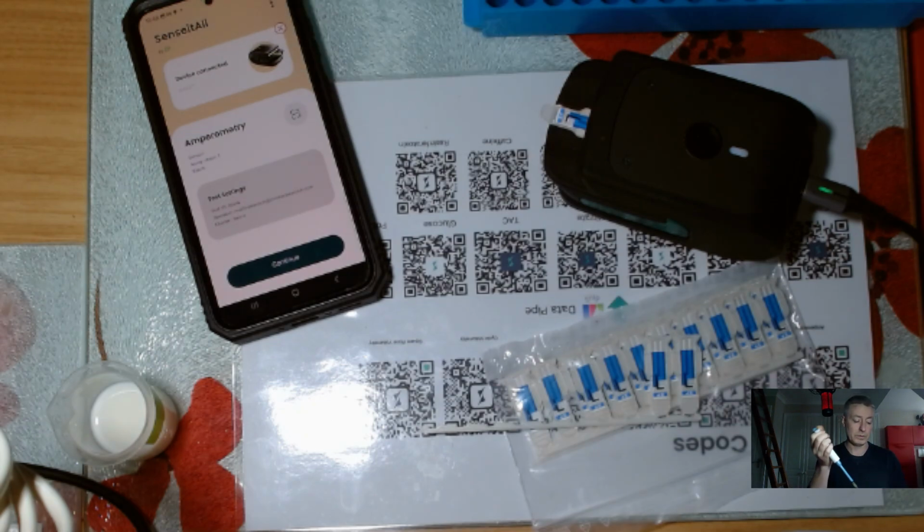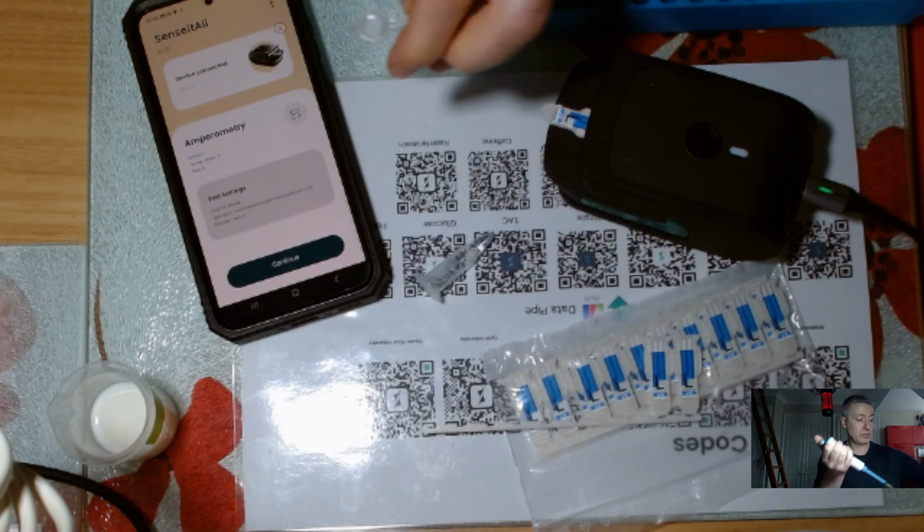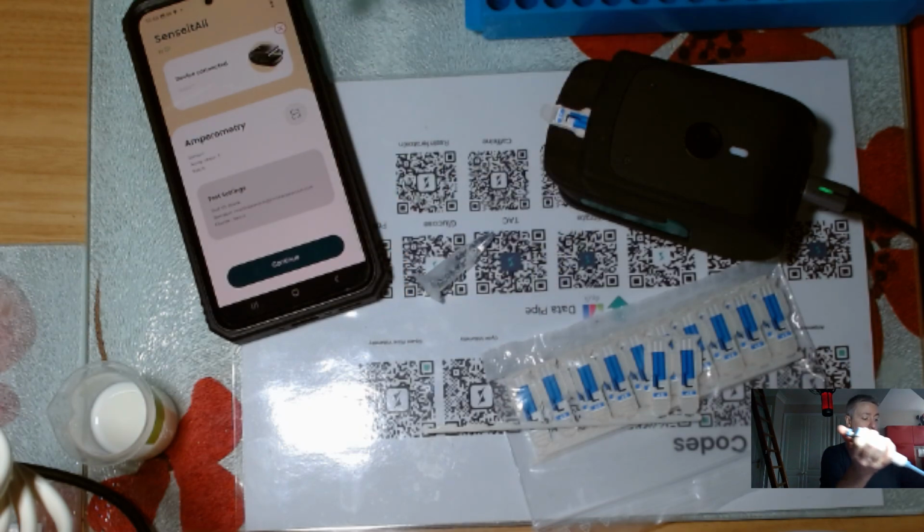So I've just formed essentially the reagent in real time in front of you. I'll put it into a new tube, which I've just done. I'm just going to put the tubes out of the way, otherwise one will end up grabbing the wrong tubes.